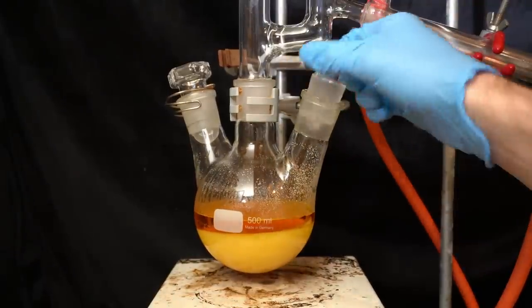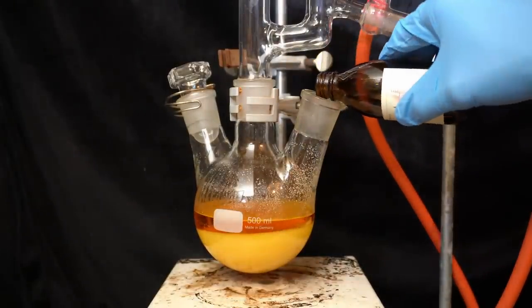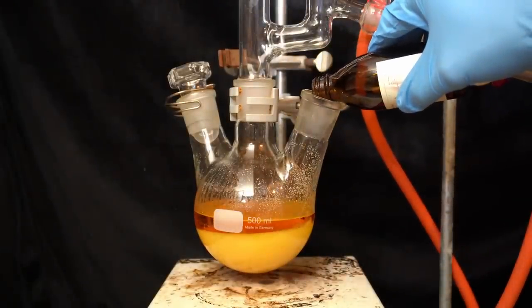The lowest spot is the ammonium salt, it's very polar so it doesn't move on the plate. The highest spot is dimethylaniline and below that is what I suspect to be monomethylated aniline. And another faint spot which isn't easy to see on camera but trust me it's there. It's on the same height as the aniline reference so there's still some unreacted aniline left.